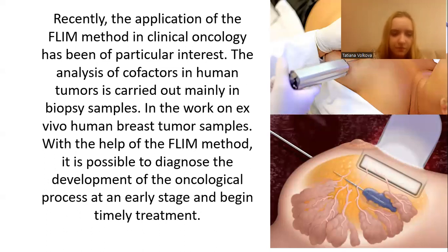Thus, the FLIM method is a specific and sensitive way to diagnose any pathological process whose cellular metabolism differs from normal. With the help of the FLIM method, it's possible to diagnose the development of oncological problems at an early stage and, of course, begin early treatment.